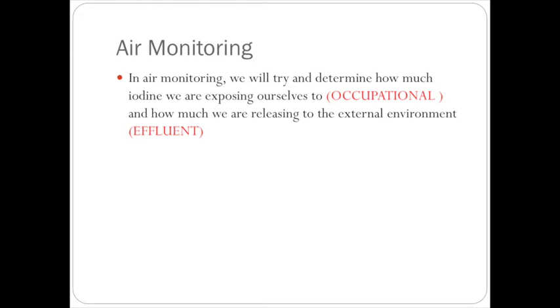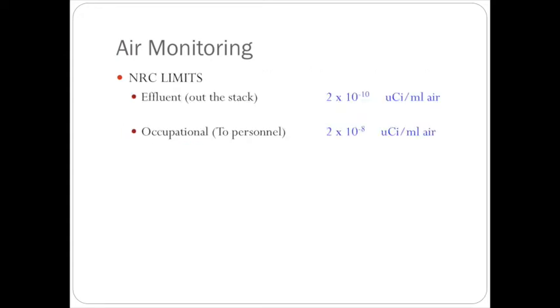We do have to worry about how much of this stuff we actually are releasing to the external environment, how much of the radioactive material, whether that be through airflow like this, or putting things down the sanitary sewage system, running it down the sink, things like that. Those are what we consider to be effluents. And so in this particular case, we're going to be evaluating the effluent, the air that's going out of our facility. Now, I mentioned earlier the limits to this are incredibly small.